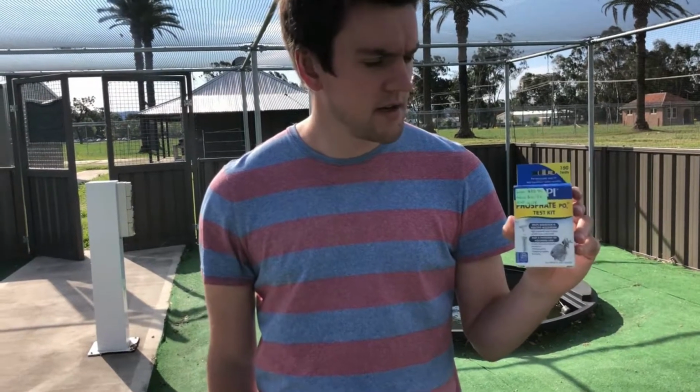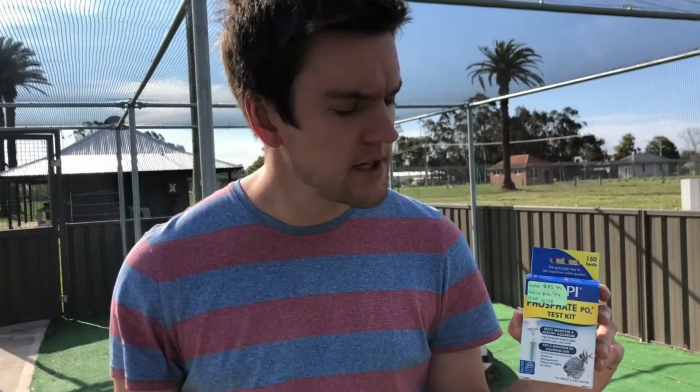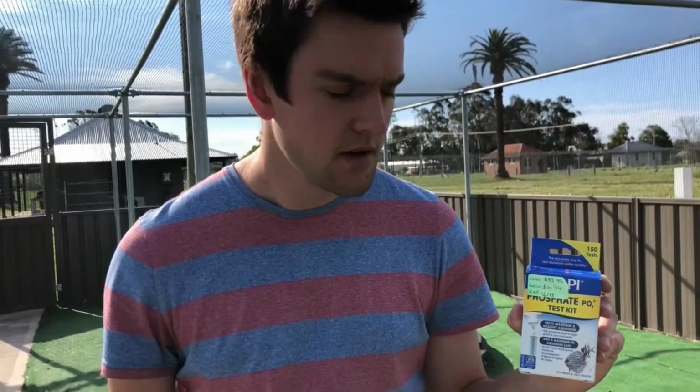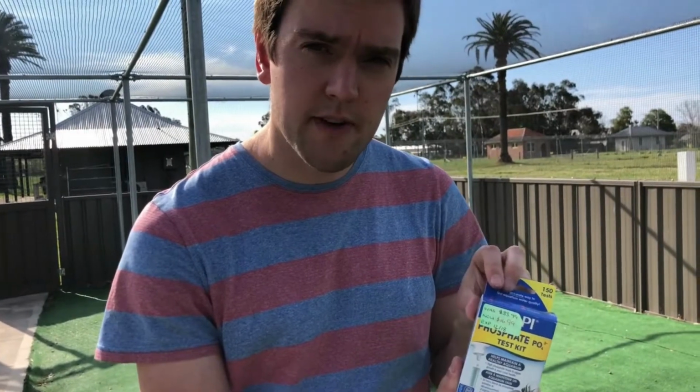Okay, phosphate is a fertiliser that can contribute to algal blooms, which can negatively impact fish health. So we're going to use this kit to sample phosphate.